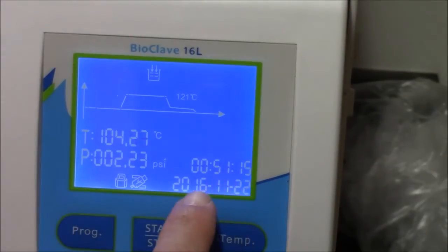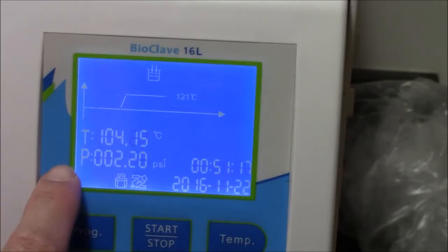Now T equals 51 minutes. We're on the cool down phase. Pressure is dropping. Temperature is dropping.